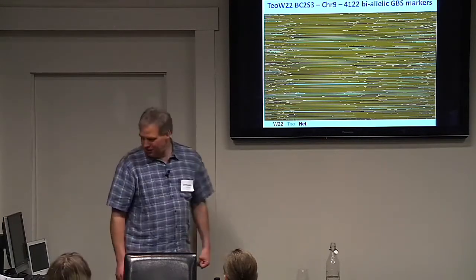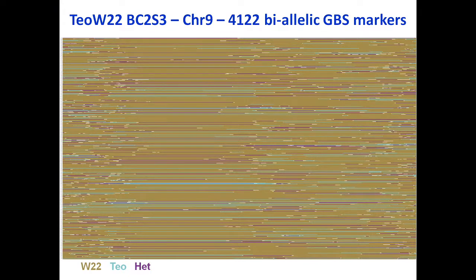So how do you look at this data? It's nice if you can, like Rob said, learn to code something, and then you can just open it up in R and make a little plot, which is, this is a PNG plot, I think.